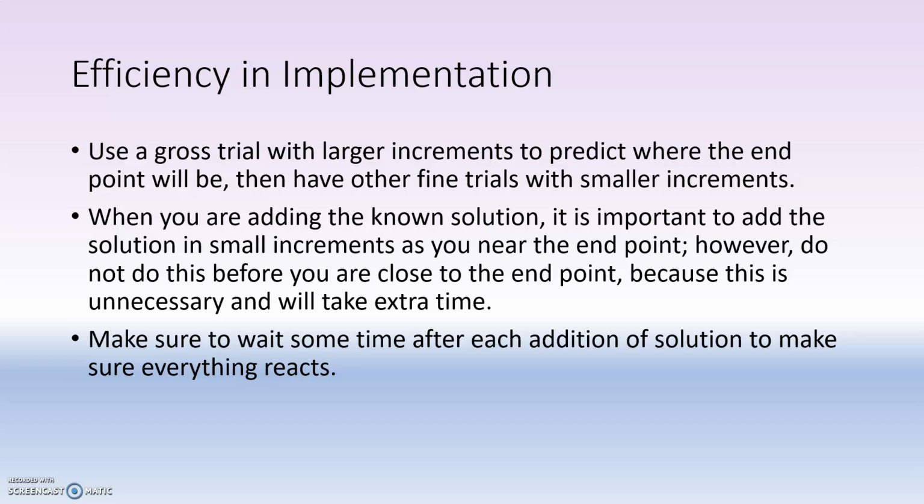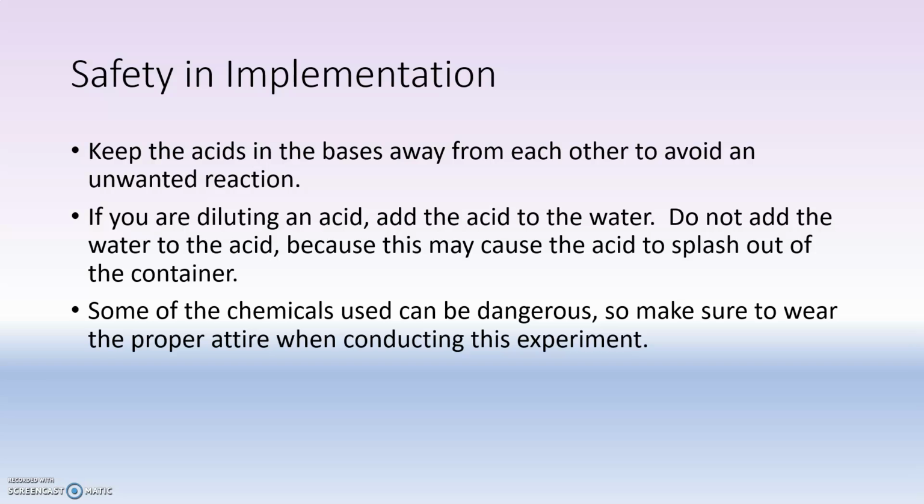However, you do not need to do this until you're close to the endpoint, because it's unnecessary and will take extra time. Part of the reason it takes so much time is that you have to wait for everything to react in the solution. If you don't, it would be a source of error if not everything has reacted.